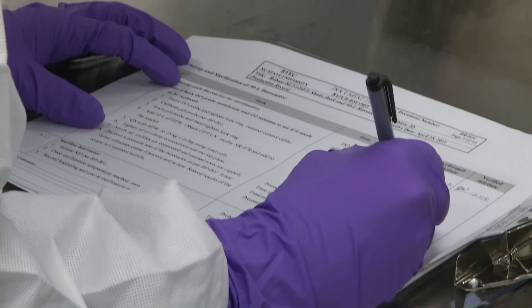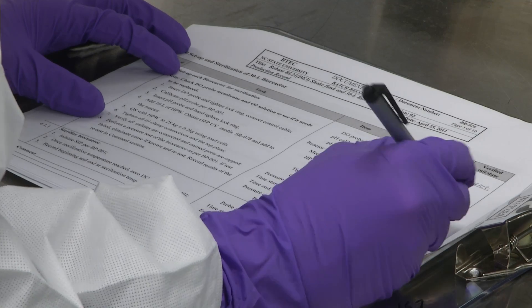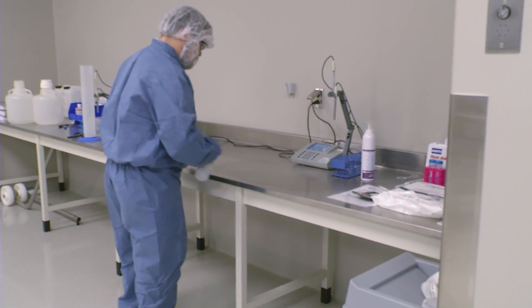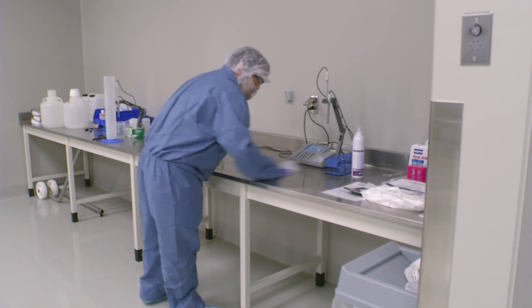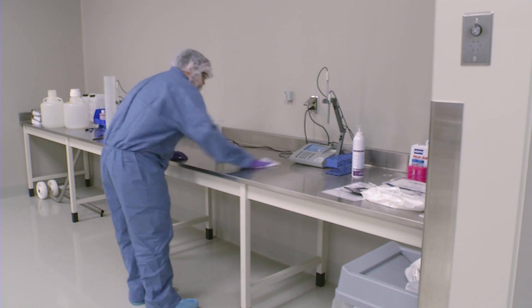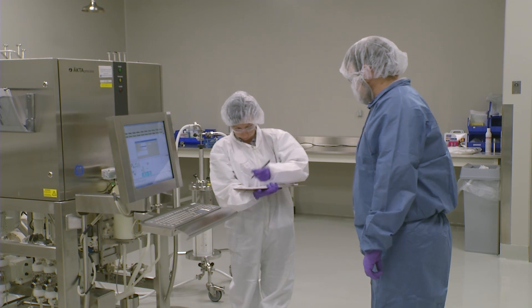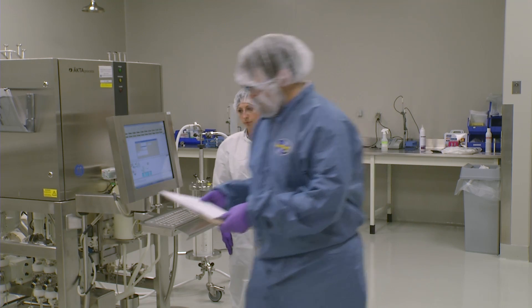The batch record also includes spaces for documenting times, activities, operation steps, and instrument readings. Before the process can begin, the purification area must be cleaned, disinfected, and organized. Any unnecessary equipment or materials are removed. All equipment must be cleaned, sanitized, and set up as required by standard operating procedures. All required materials and documentation must be gathered and prepared before the process may begin.